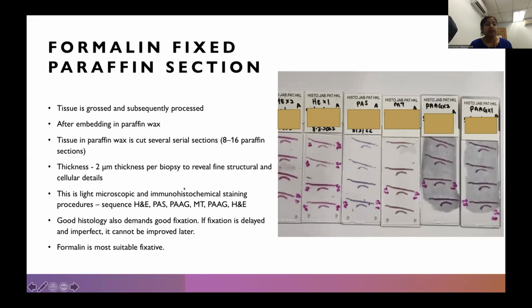Okay. In different centers, like in the UK, they would actually do a slide, skip a slide. That means at certain levels, like if you do level 1, level 2, level 3, the 3rd, 4th, few levels will be removed as unstained and kept aside, and then they will stain the 7, 8, 9 levels. It goes like that, so different centers, different styles.